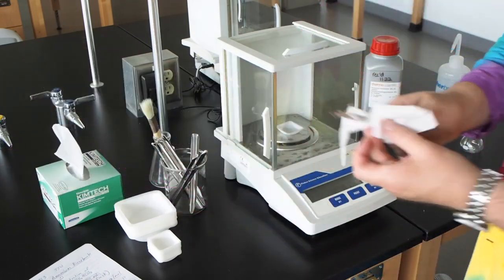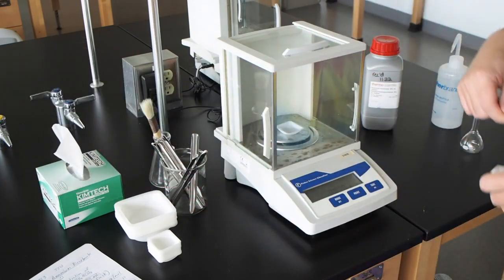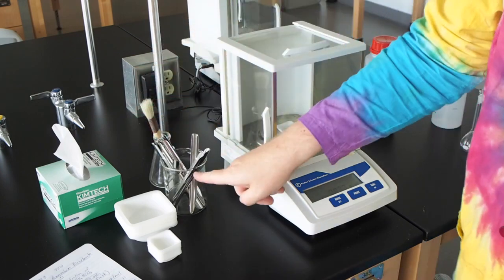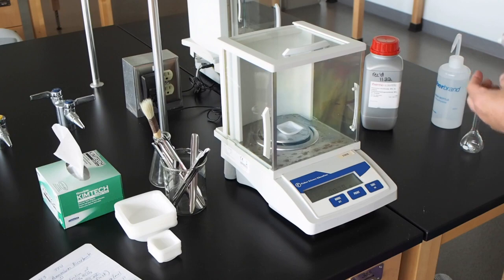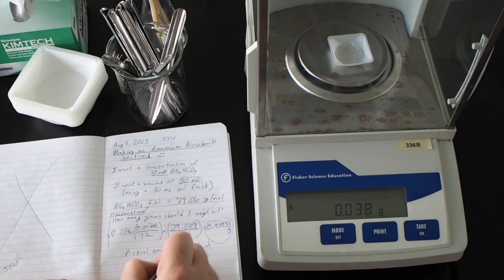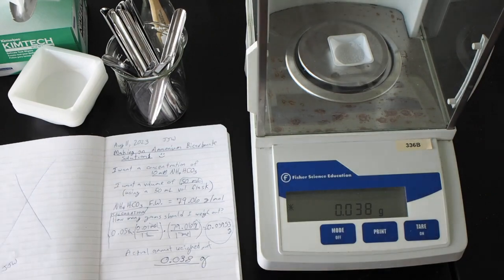I'm done using my spatula. I need to clean that off. It needs to be clean before I put it back in here, because everyone relies on that stuff being clean. This goes in the garbage. As you can see, I've got 0.038 grams of ammonium bicarbonate in the weighing boat.